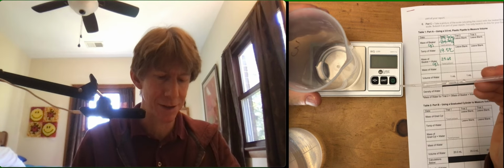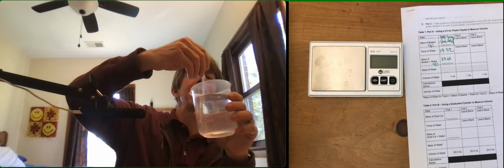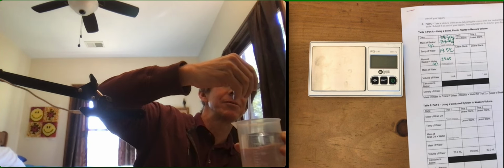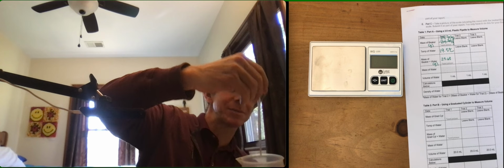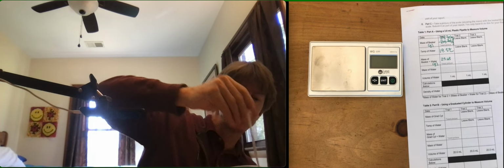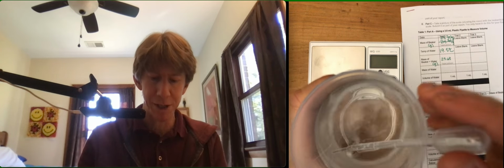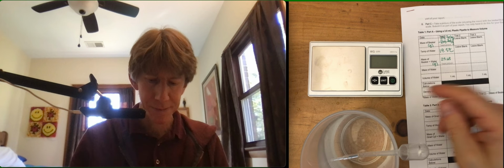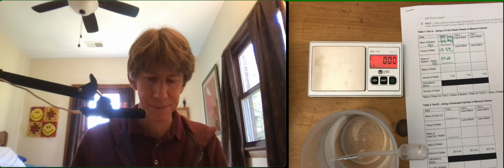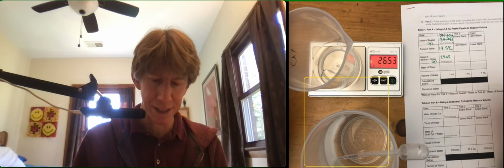My scale already turned off, but now I'm going to suck it up to 1 in the pipette, that line, just as closely as I can, and then run it right on that line. And this is the thing you want to be really careful about, because you want to get good precision, good repeatability. When you're finished with your pipette, you can just put it in the water. Then I'm going to put on the scale. Wait for the dot to appear. Put the beaker on the scale.